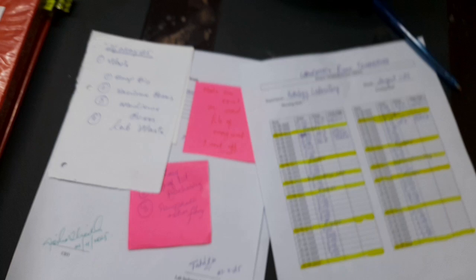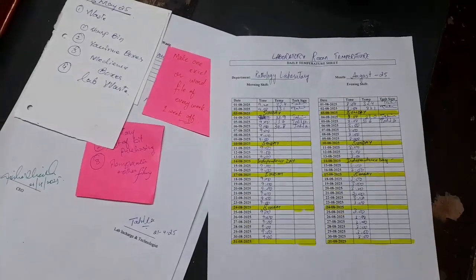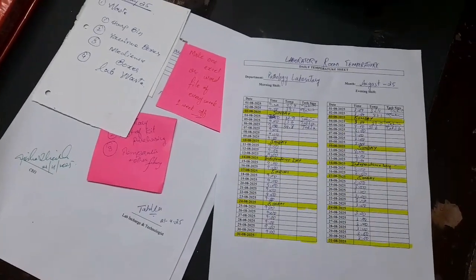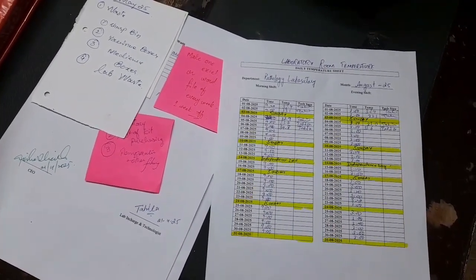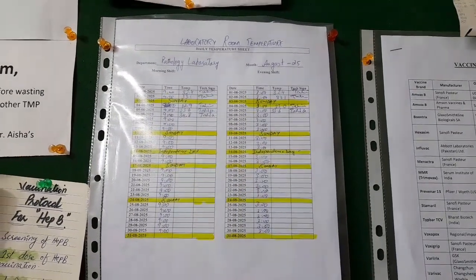Now moving towards the lab. First thing I do whenever I enter the lab, around 9 a.m., is to maintain the temperature log sheets, which are of two types: the room temperature and the fridge temperature. Fridge temperature is more necessary because it maintains the cold chain for the vaccine, reagent kits, etc.